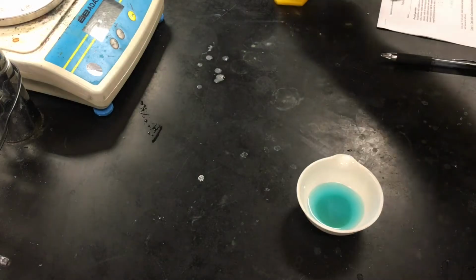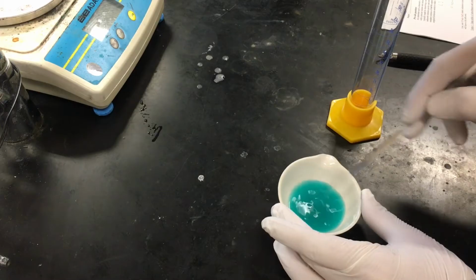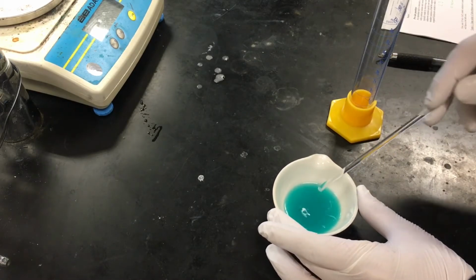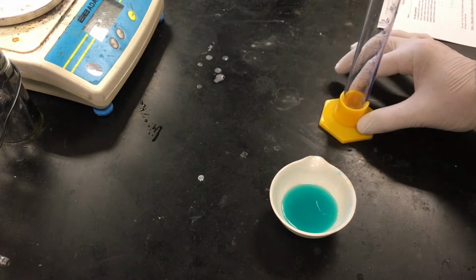And we're going to make our solution, which means we're going to dissolve the solute. Once the solute is all dissolved, we're going to pour this into our graduated cylinder.